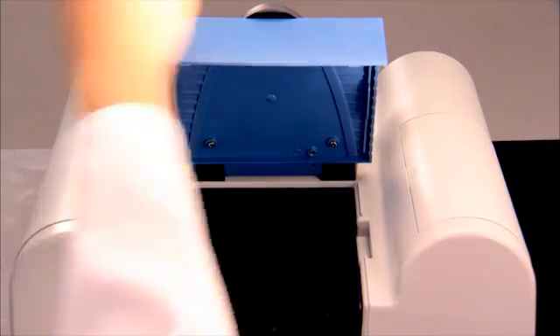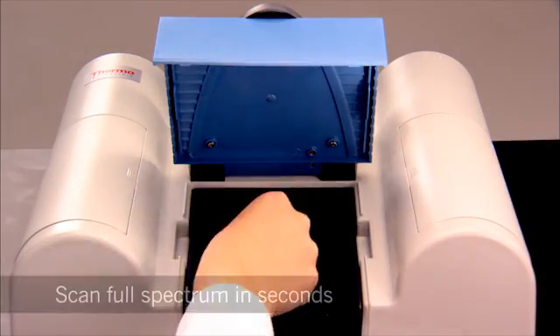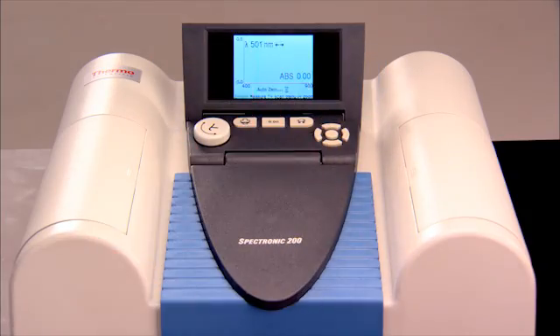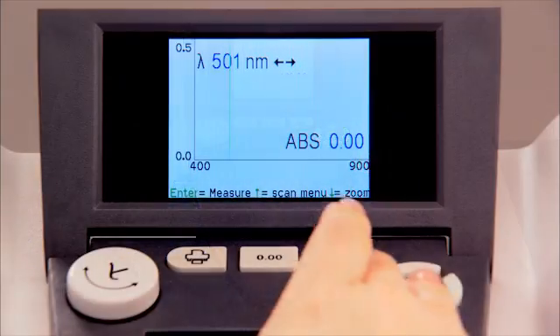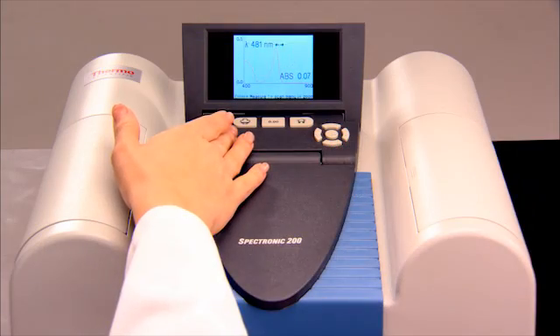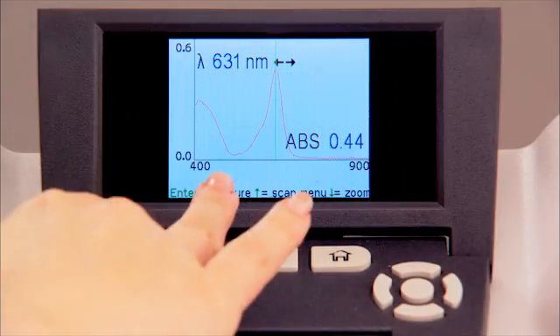The SPEC 200 scan mode gives you the ability to scan the full spectrum in seconds. To find lambda max, just zero it, measure your sample, and use the cursor to identify the peak.